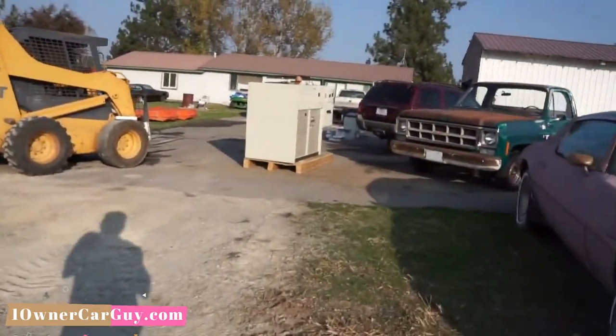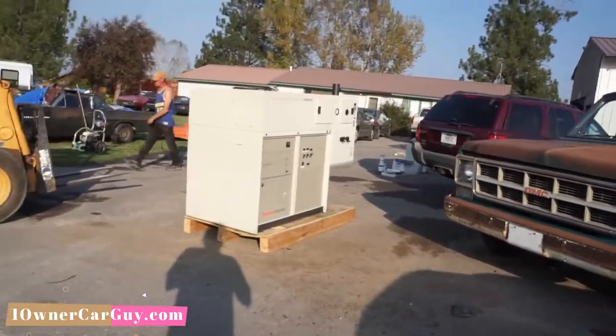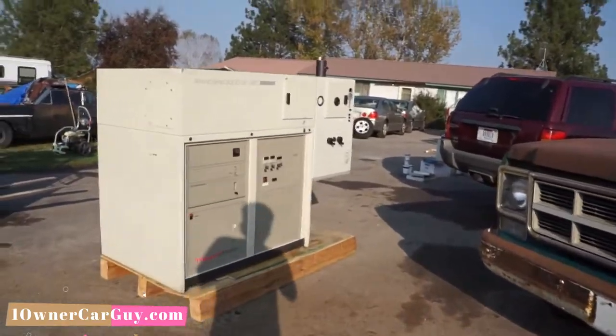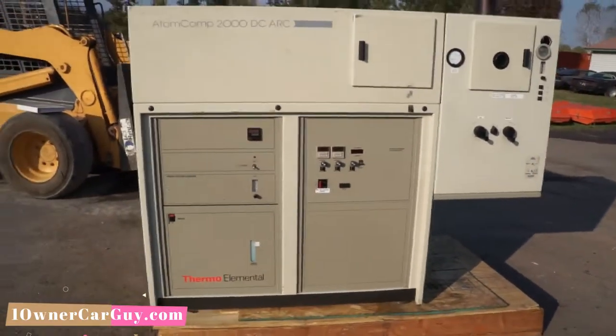But today I've got a spectrometer — a digital spectrometer. This is it. This is what we got here. It's pretty nice.